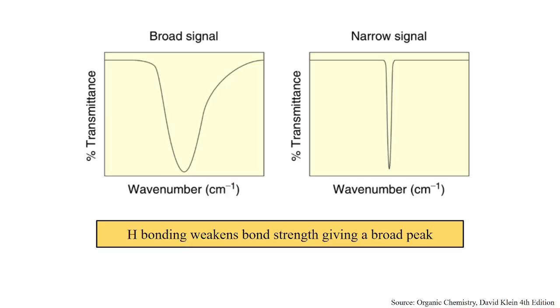In some cases, you'll see 2 alcohol peaks, one narrow and one broad, in the same spectrum. To achieve this, you will dilute an alcohol in a solvent where the solution is neither concentrated nor diluted. The reason you'll see the two signals is that some of the OH bonds will do hydrogen bonding, while other OH bonds don't. An example of all these characteristics is typically seen in carboxylic acids, right?